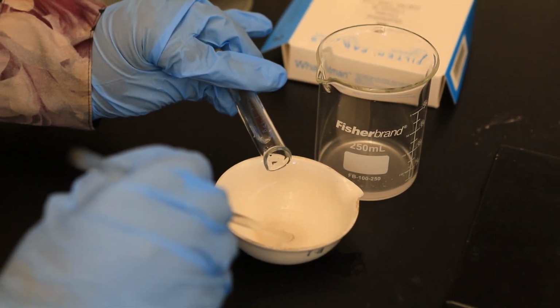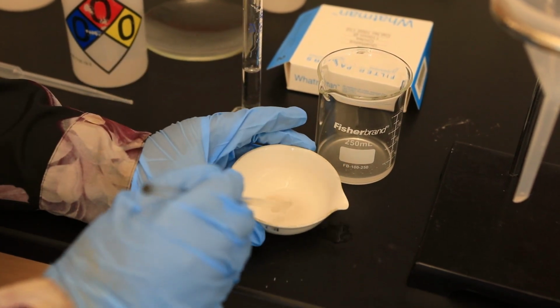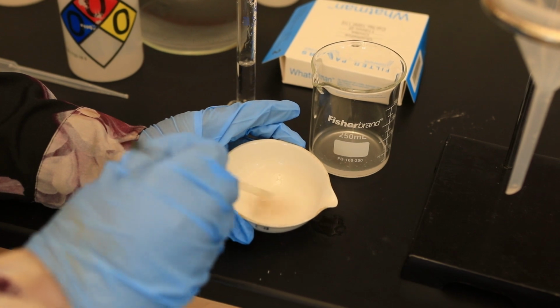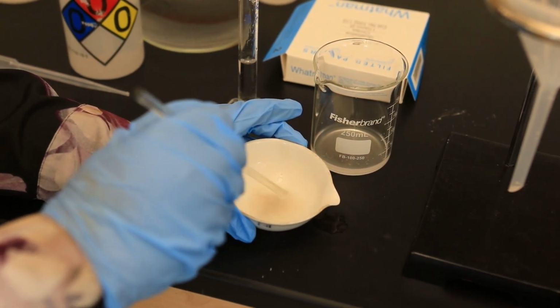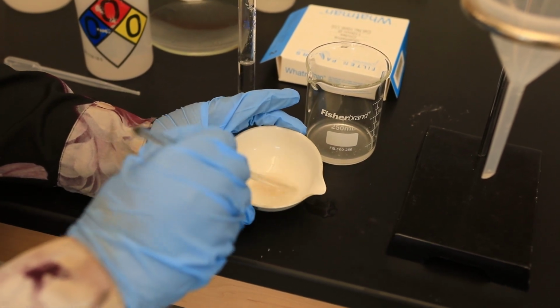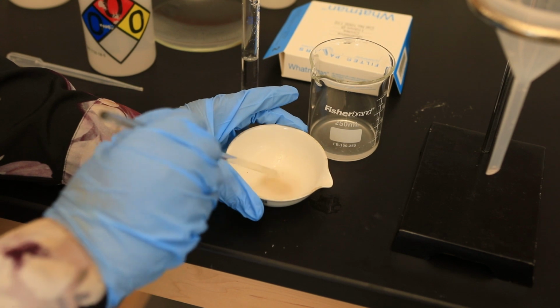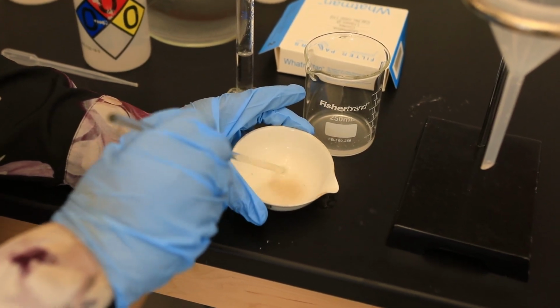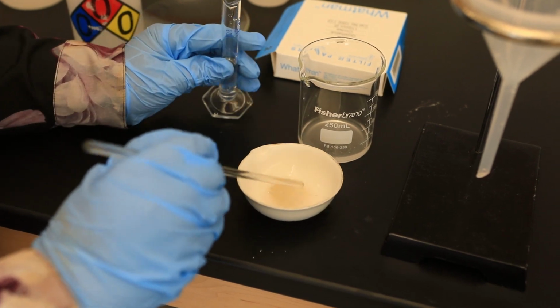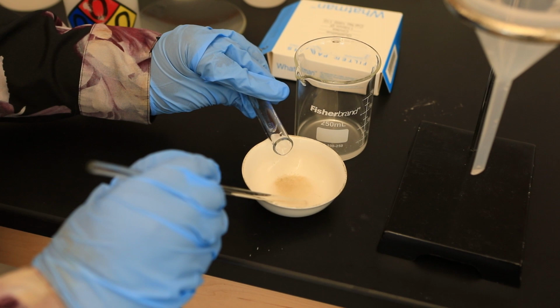But not only do I need to add this slowly, I also need to mix. You will see that the gas is released because you see that fizzing. That just indicates the evolution of the gas CO2. Notice that that white powder is also being converted to an aqueous solution. You see that the white solid calcium carbonate is being converted to our calcium chloride solution.